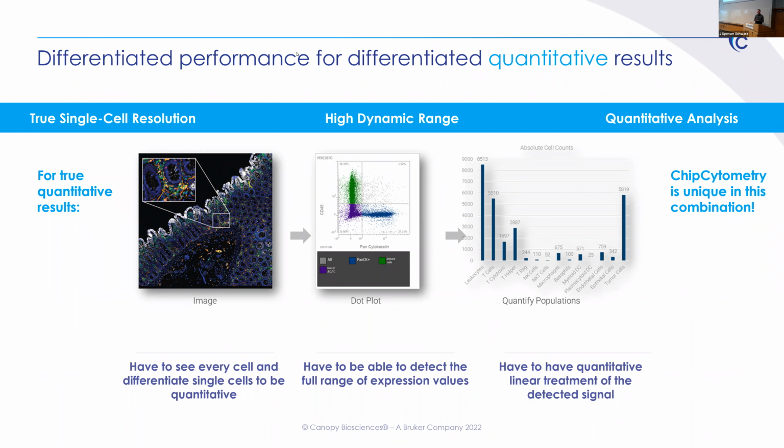Yeah, absolutely. So actually, a question did come in from Dana King. She says, really nice introduction to the technology and platform. Regarding the analysis, one, are multiple exposure times used for quantitative results? And two, if so, is variance stabilization or a similar normalization step recommended to account for the higher dynamic range expected in the data?